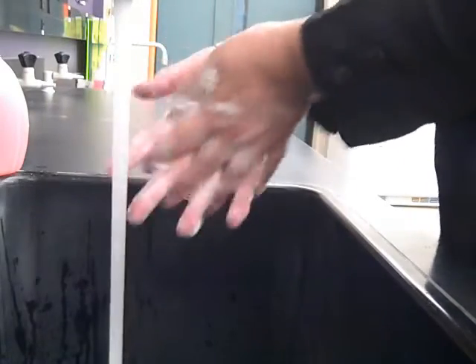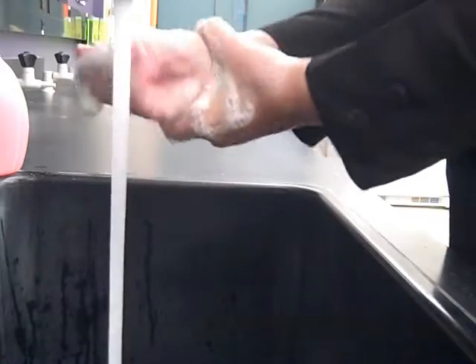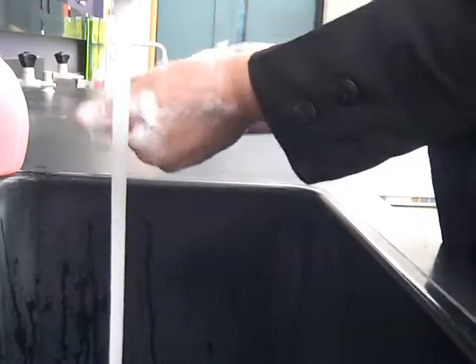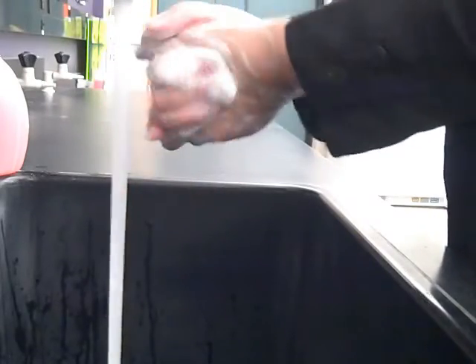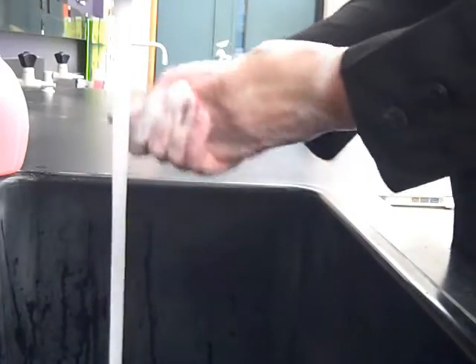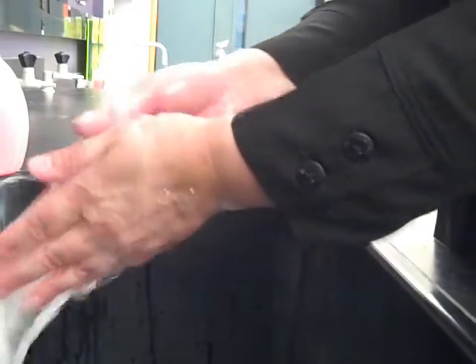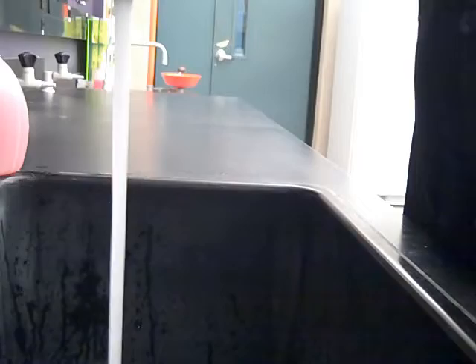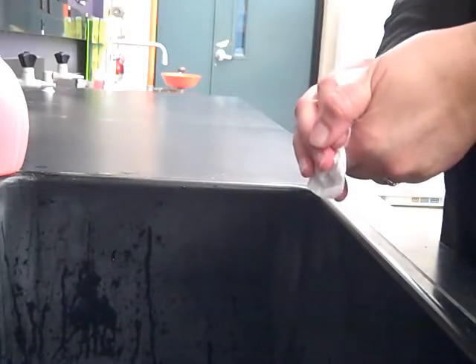When you're washing your hands, pay close attention to your nails and the area around and under rings. You're going to dry your hands with a paper towel and then use that paper towel to turn off the faucet. This paper towel goes into the regular or black trash can.